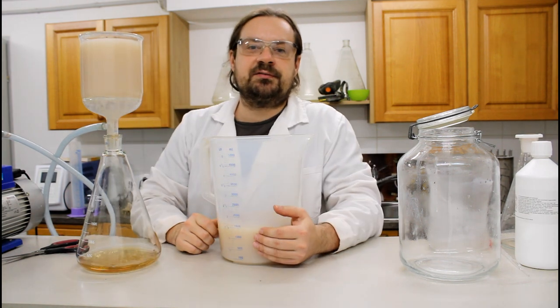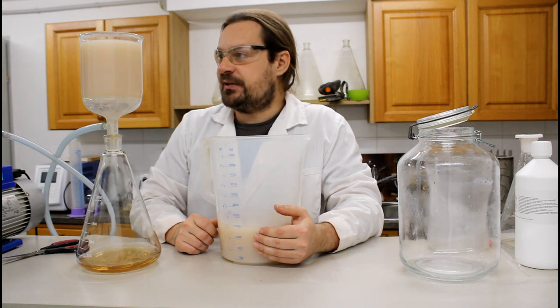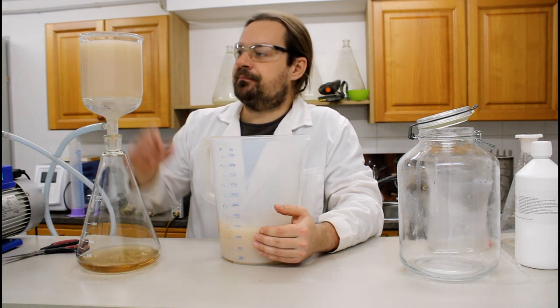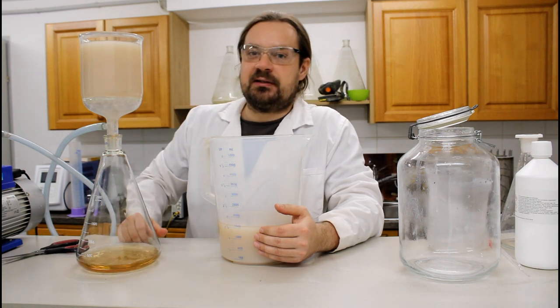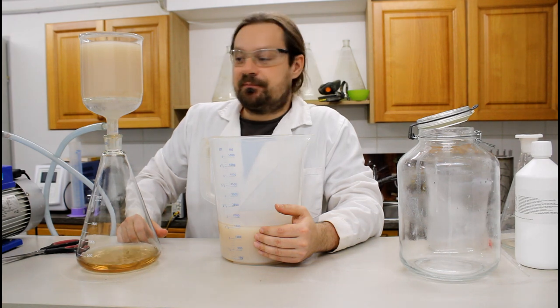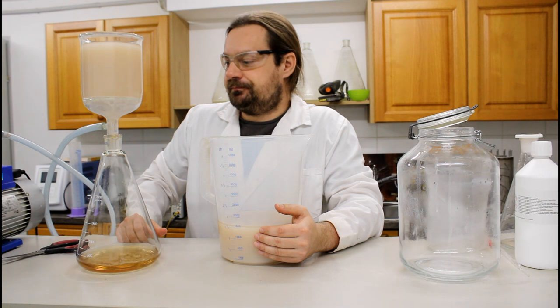And again, we have to wait till the filtration is done, but this time it won't take so long because the hydroxide crystals are actually rather big, so the filtration won't take that long.